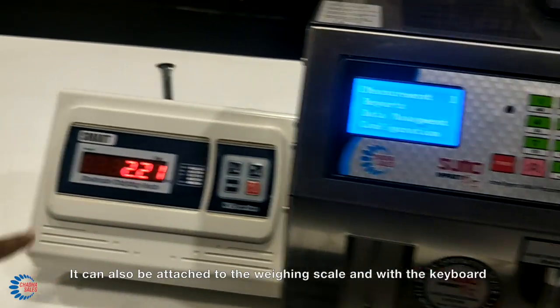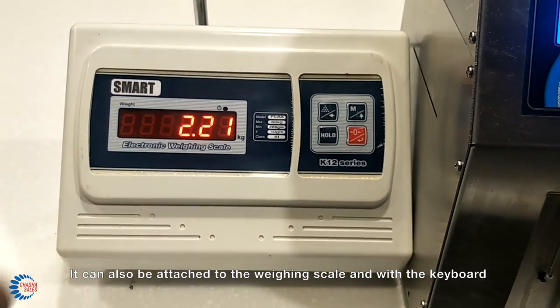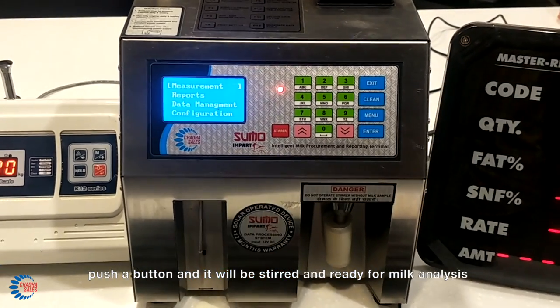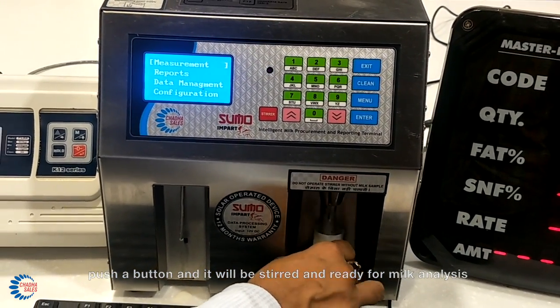It can also be attached with a weighing scale and with a keyboard. Take a milk sample, push a button and it will be stirred and ready for milk analysis.